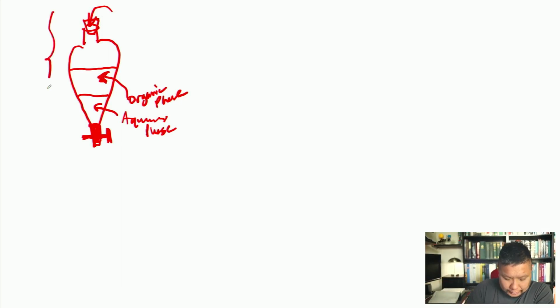You do that, and you can flip it back again so it's right side up, this way right here. This is right side up. And then the layers separate again, and then all the inorganic and the polar stuff that wasn't your product will move and get cleaned out of the organic solvent and move to the aqueous layer, or the water, because it's more soluble in water than it is in the organic phase.